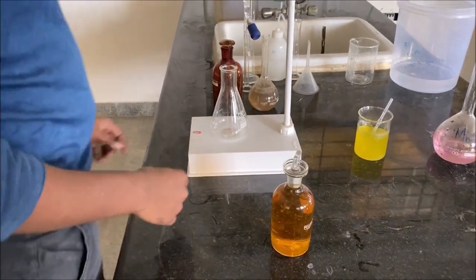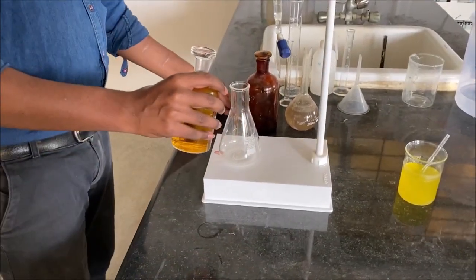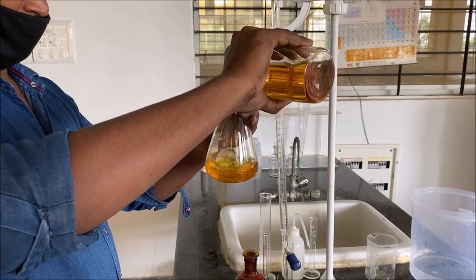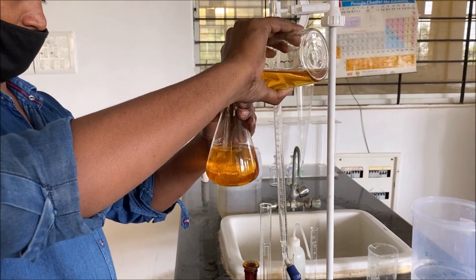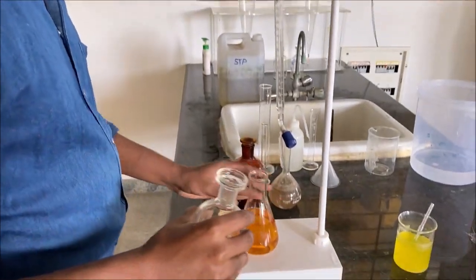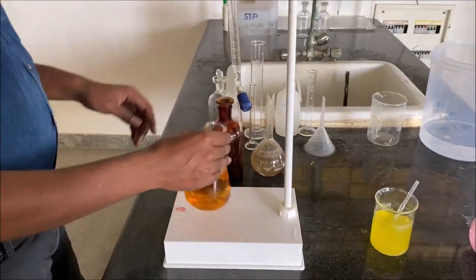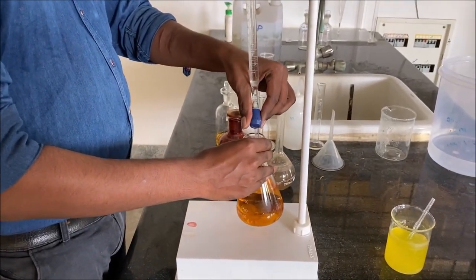The solution is titrated against standard sodium thiosulfate solution. 203 ml of solution is taken into the conical flask for titration. Since the conical flask itself has graduations, we can measure 203 ml of solution approximately into the conical flask. In the burette, standard sodium thiosulfate solution is taken for the titration, and the solution in the conical flask is titrated until it turns pale yellow.